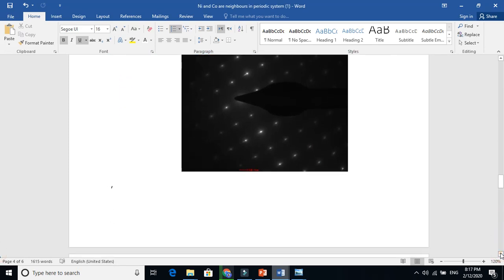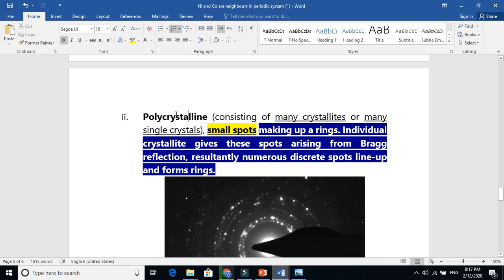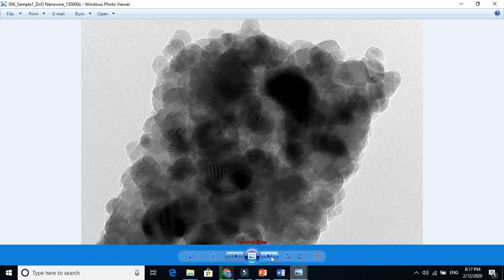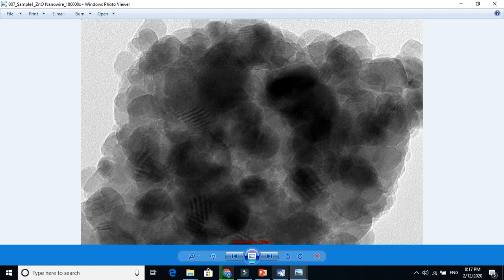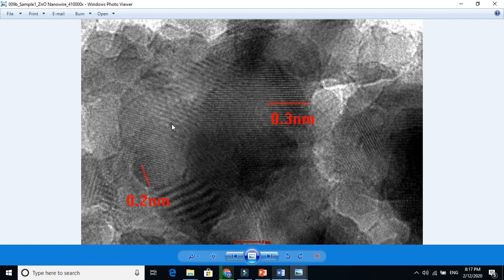Now let us go to polycrystalline material and how it gives a diffraction pattern. Polycrystalline material gives a ring shape. Why ring shape? Because polycrystalline is composed of many crystallites or many single crystals. When you zoom in, you see many grains, many crystals. In some cases, crystals are oriented in one direction; in other cases, another direction. So the reflection comes from one plane in one direction, from another plane in another direction, and this is why it makes a ring shape.